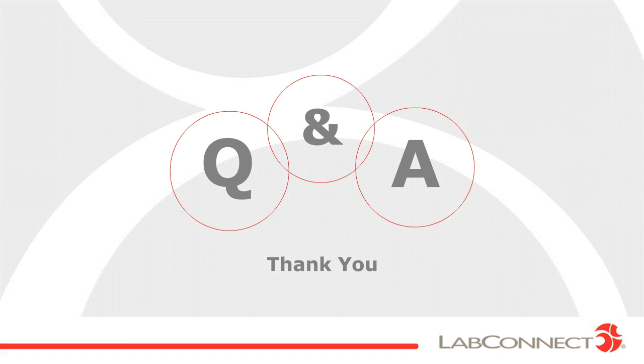Okay, great. Thank you. I was just going to add to that real quick. So we also have, for our DNA and RNA extractions as well, qualification processes in place with our laboratories. And with those, we look at concentration and purity outcomes. So again, just to add to what Joe said, we do ensure that the laboratories are running multiple analysts, multiple runs of whatever process they are doing, just to ensure that everyone is qualified.